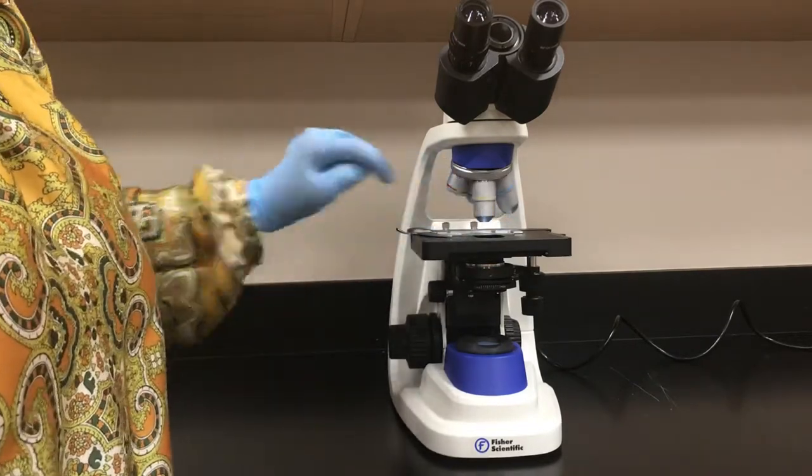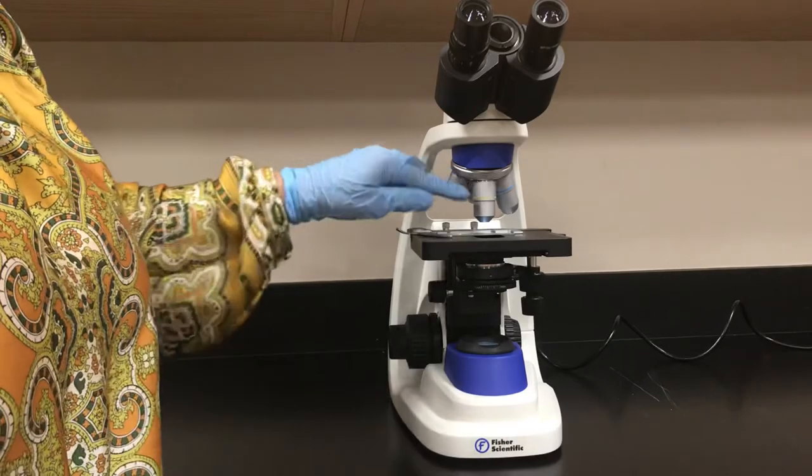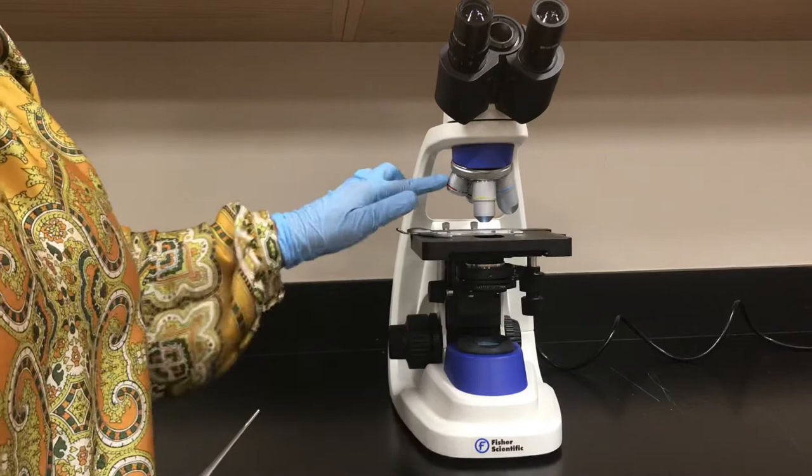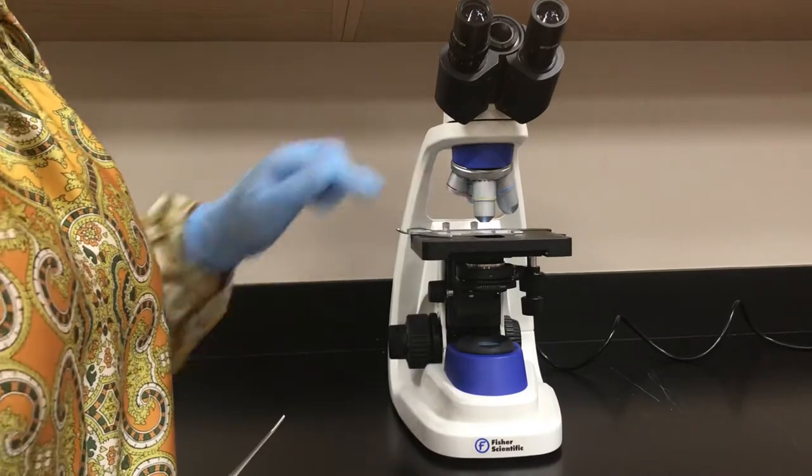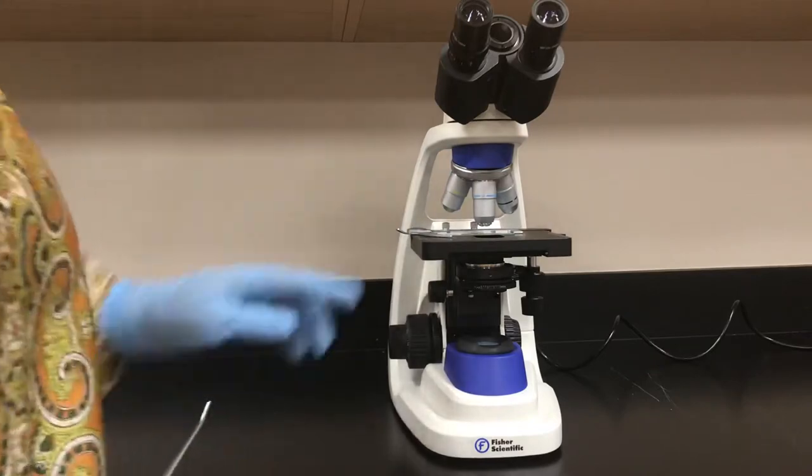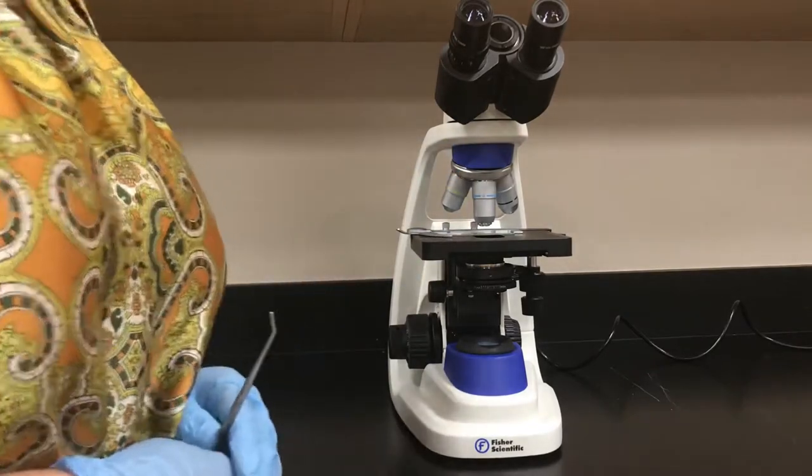The yellow color coded objective we call low power magnification. It magnifies 10 times. Red color coded is 4 times, yellow one is 10 times. When you turn to the blue one, the blue color coded high power objective magnifies 40 times.